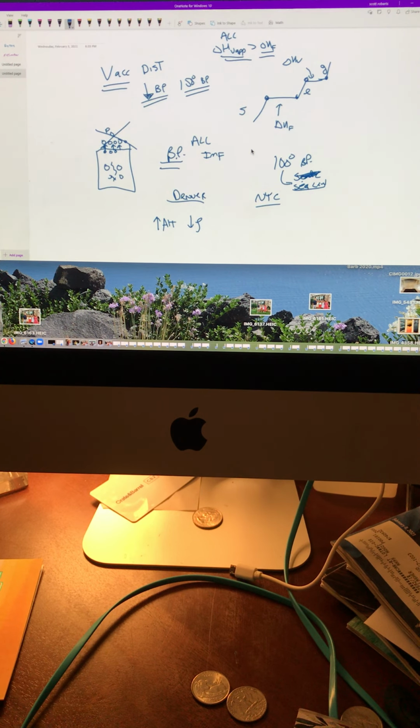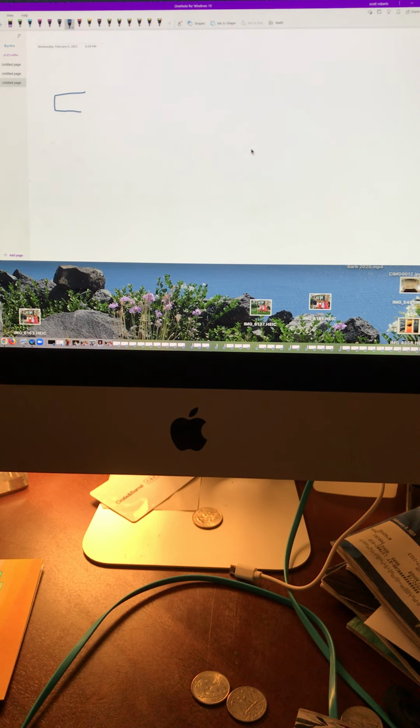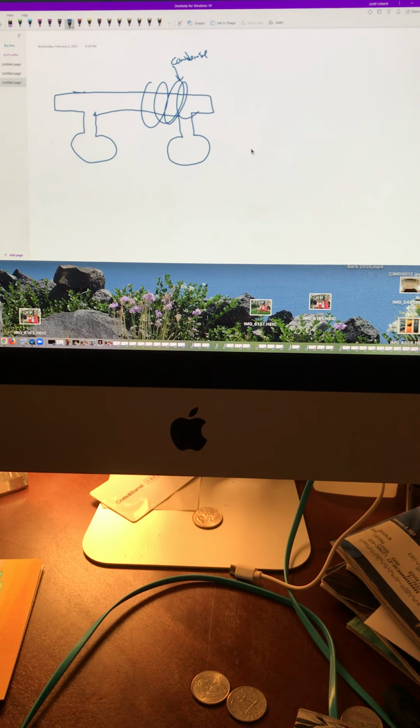All right. While we're on the topic, let's do gas chromatography. Gas chromatography is almost like distillation. So you have a tube, and you have another tube. There's a condensing wire that condenses and cools the gas we're going to make. The difference between this and distillation is nobility. We've got a noble gas in here. Oh, sorry, Rebecca. This is gas chromatography. I kind of like it. So now what happens? Well, we've got two unknowns here, A and B.